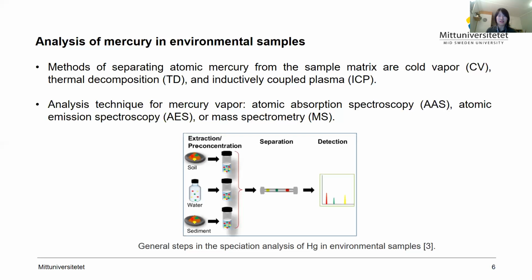The analysis techniques are various. However, all these laboratory analytical methods require a pre-treatment process of the soil and sediment samples with acid digestion. This step is time-consuming and easily causes cross-contamination among samples. A rapid screening technique for detection of mercury in a variety of environmental samples is desired.